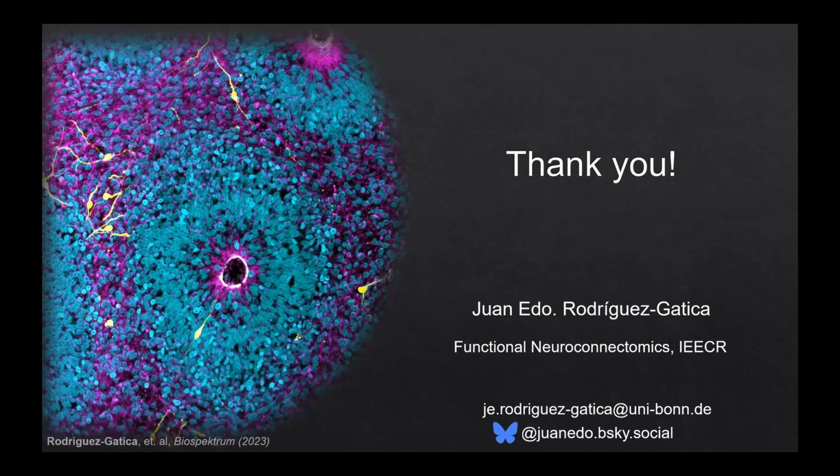So we have an upright system, and we just glue the gel in. The gel is inverted in the sample chamber, and we just kind of glue, right? It's not gluing the sample, but we use polylysine. Polylysine is really stable. If you put it on a coverslip, you can even flip your sample. The gel will be there.